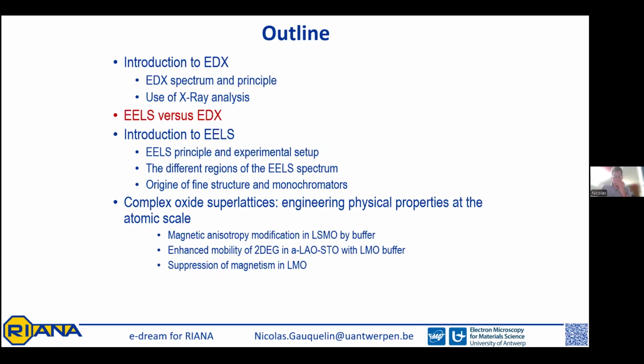So, as Katalin introduced you, I will talk about EELS.